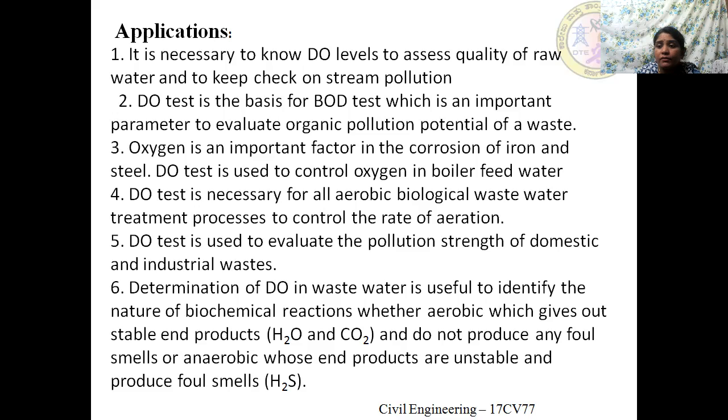Oxygen is an important factor in the corrosion of iron and steel. DO test is used to control oxygen in the boiler feed water. Dissolved oxygen test is necessary for all aerobic biological wastewater treatment processes so that we can control the rate of aeration. DO test is used to evaluate the pollution strength of domestic waste as well as industrial waste.